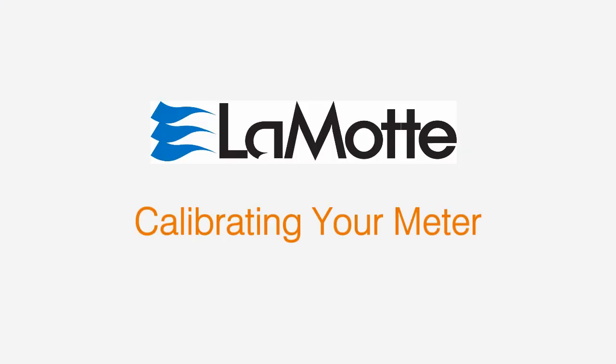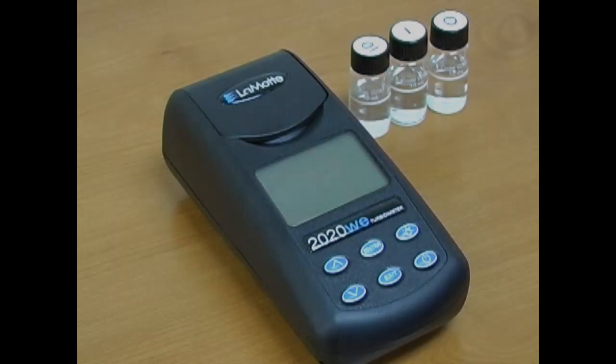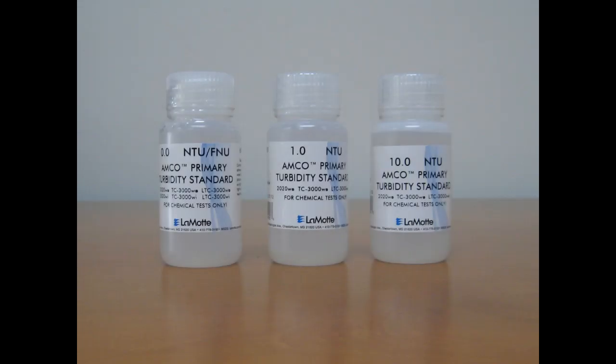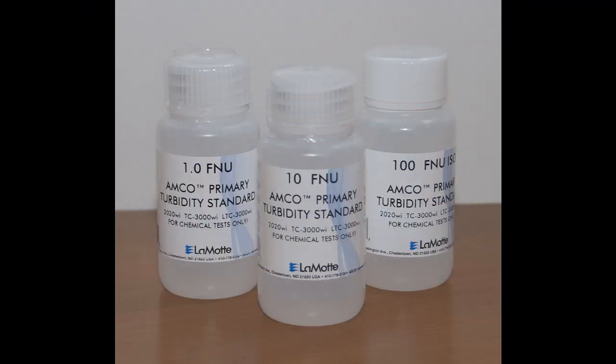Always be sure to calibrate your meter over the smallest range possible. Select standards that will encompass your sample range. We recommend that you calibrate daily and that only AMCO standards be used. Any other calibration standard will result in an improper calibration of the meter.